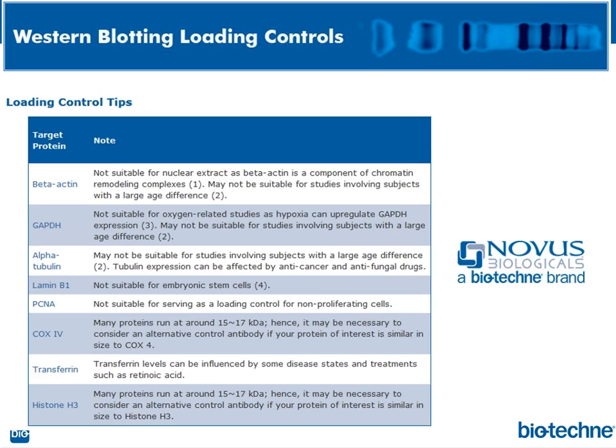And of course, these days you've got YouTube, you've got JoVE videos, and they get really detailed. And by the way, for the arrays that we've been talking about, there's a nice video from the R&D Systems website that shows it from our lab. You can even see what Dave Finkel, who works at R&D Systems and helped develop these arrays, looks like, but it shows you exactly A to B to C how to do these arrays, and it's quite powerful. So I would utilize those types of tools, and that would be probably the best way to run a Western. Hook up with someone that really knows what they're doing.